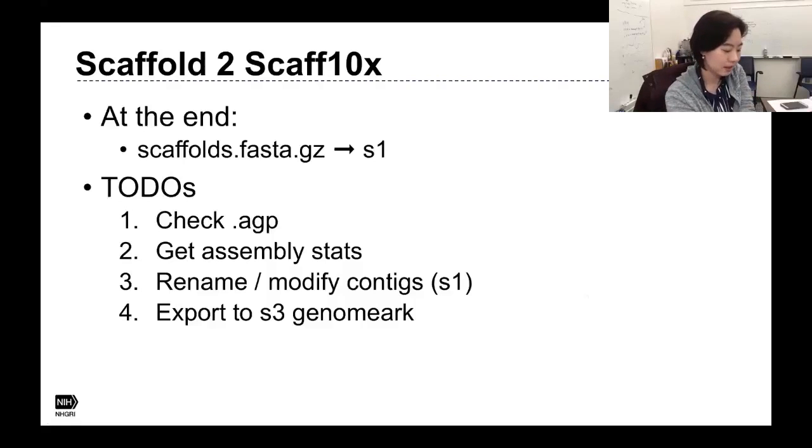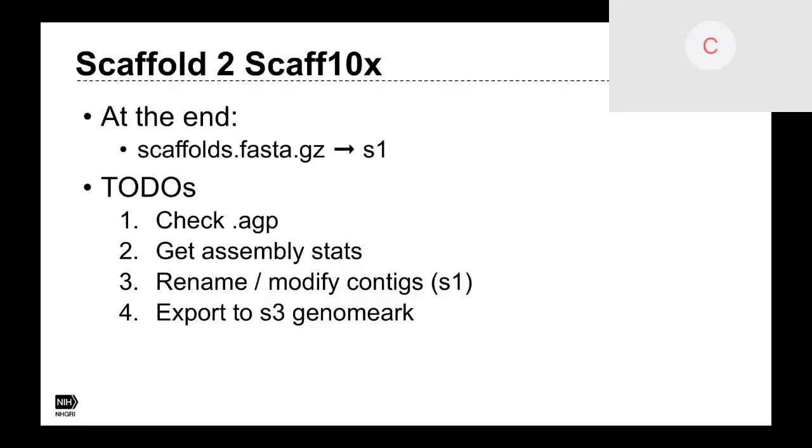Yeah, and it's important to note that Long Ranger does not accept malformed 10x reads. Thanks, Chai, for mentioning that. Yeah, it will crash explicitly. It basically doesn't know that this file exists. So, right.